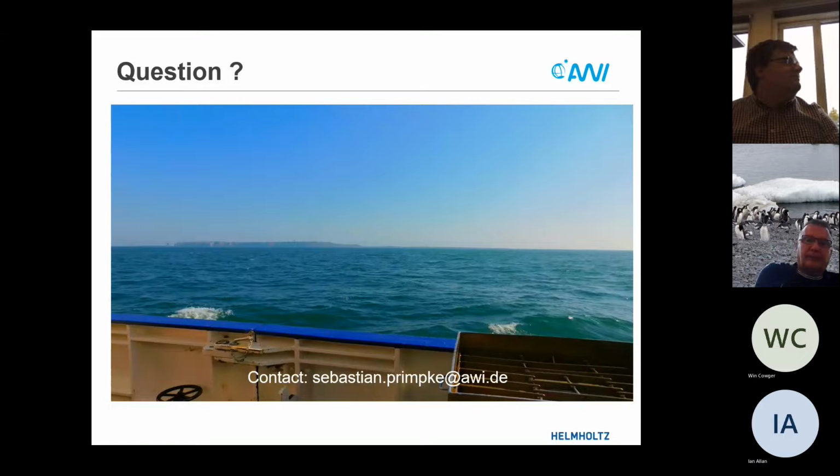What is that technique? Because using the correlation coefficient alone, you were saying that it was a good match. Yeah, but it was a good match all the same. People wouldn't have seen the structures of the visual image. So this is what makes the decision that something is off here.